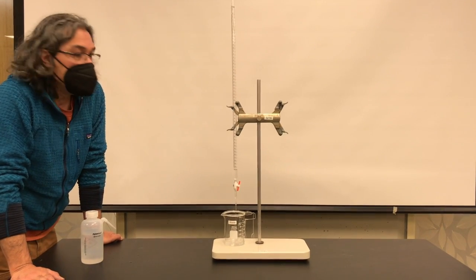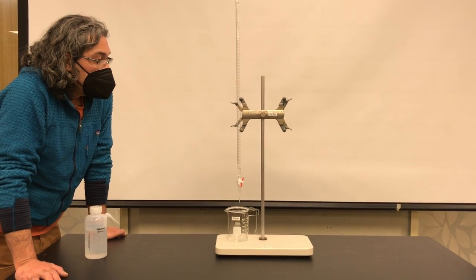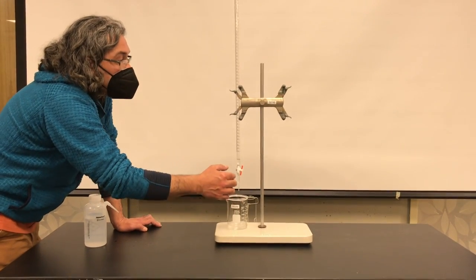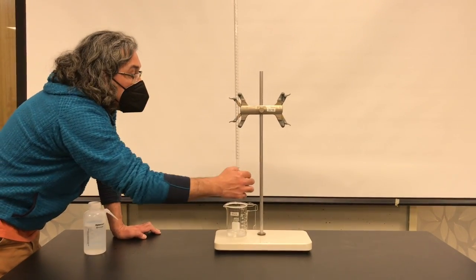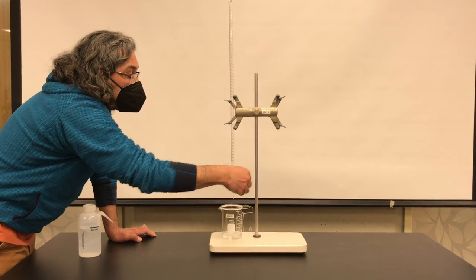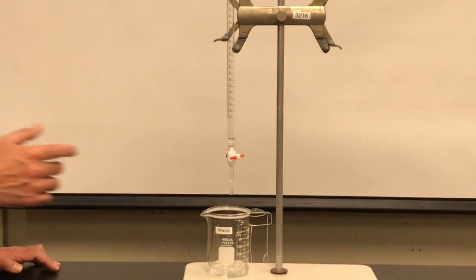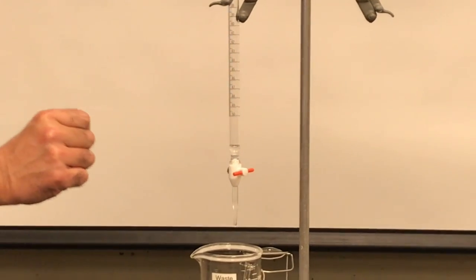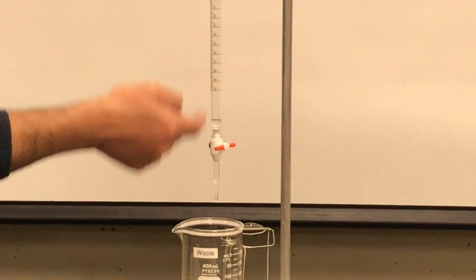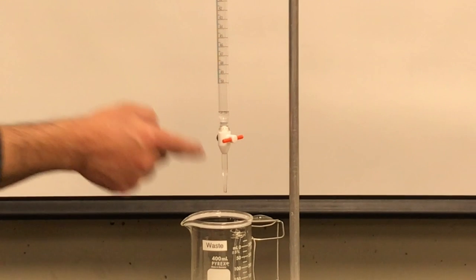So now I've rinsed the burette 3 times with water. I'm watching the water flow out of the burette, and I'm going to stop it when it gets close to the valve. So notice that I did leave a little bit of water, and the reason for that, as I told you, is because I don't want air moving into the tip of the burette, because air can be really difficult to get out of the tip.